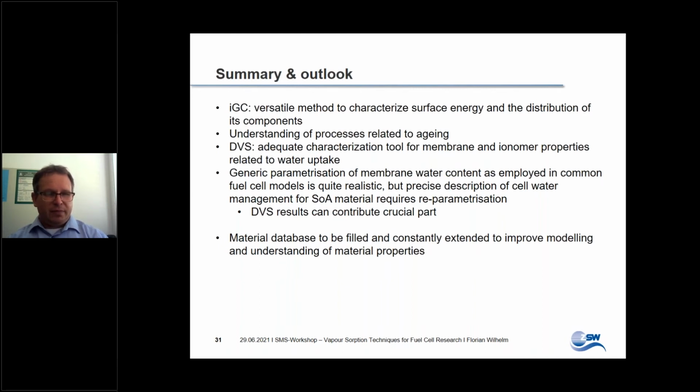So overall, we're developing and maintaining a material database which is to be filled and constantly extended to improve modeling and understanding of the material properties.